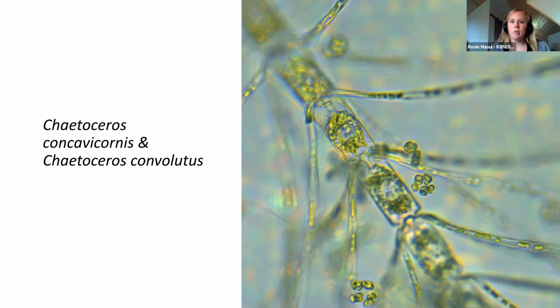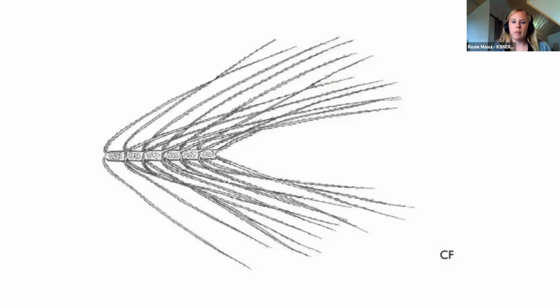Thomas, actually, will you go to the next slide too? Awesome. See how big and intense those spines are. That's really characteristic of Chaetoceros, these big spines that can be attached to the different cells. These spines can lacerate the delicate gills of small fish or cause an irritation. And when they cause that irritation, a fish reacts in a way that we do when we're sick. They release a ton of mucus. The goal is trying to flush these things out, but they're so clogged with Chaetoceros that they actually end up dying. That's what ended up happening in this case. They were suffocating to death.